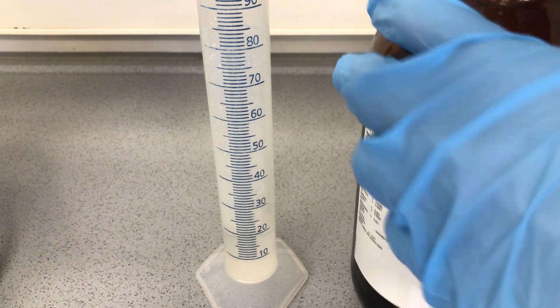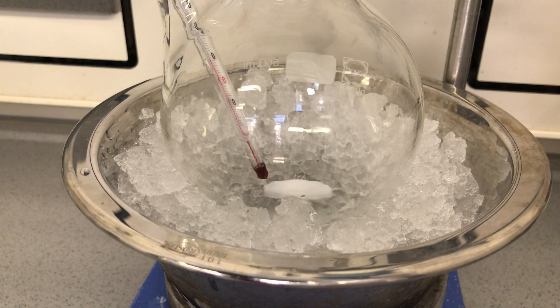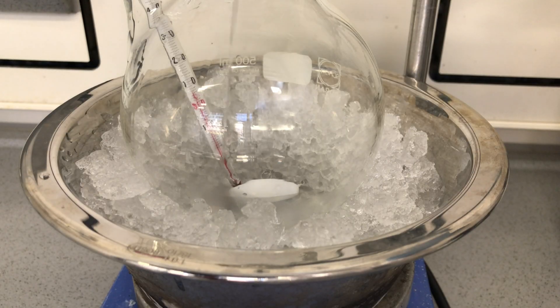Remember not to pour any acid back into the storage bottle. The nitric acid was added to a round bottom flask sitting in an ice bath. Then 20ml of sulfuric acid were measured out and under stirring they were very slowly added to the nitric acid.